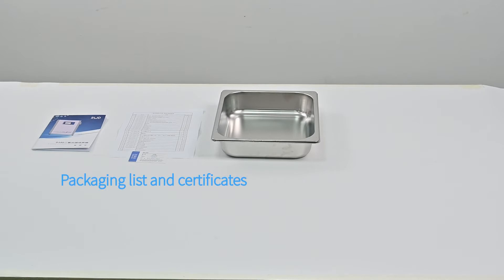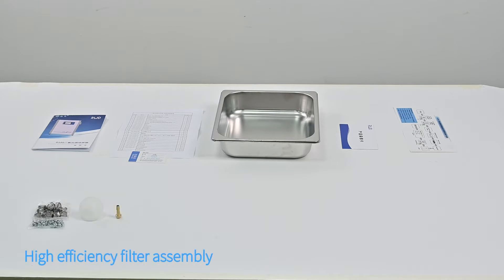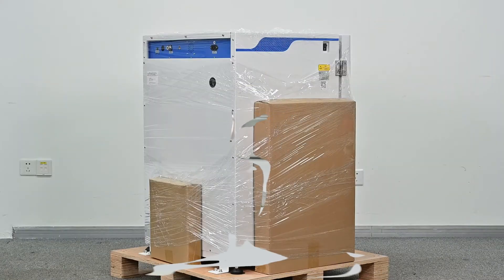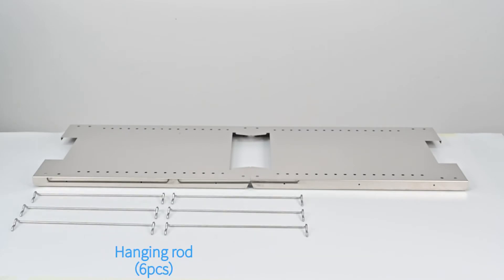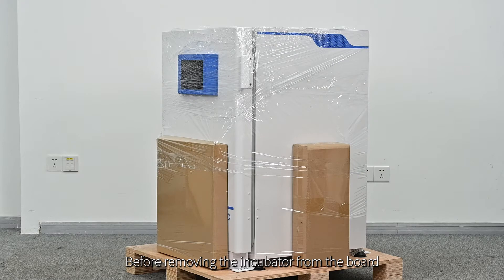The accessories contained in the reservoir accessories box are: water tray, user manual, packaging list and certificates, warranty card, easy operation guide, clamp, high efficiency filter assembly, fast connection peg, rubber plug, pepper filter, stacking racks, power cord, and installation tools. The accessories included in the vertical shelf accessories box are: vertical shelf, hanging rod, and ejector rod.